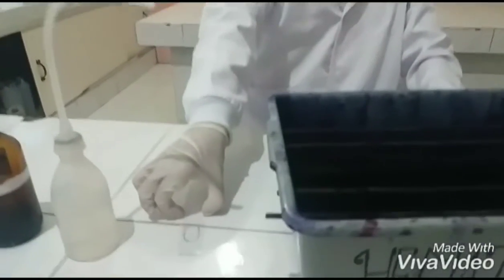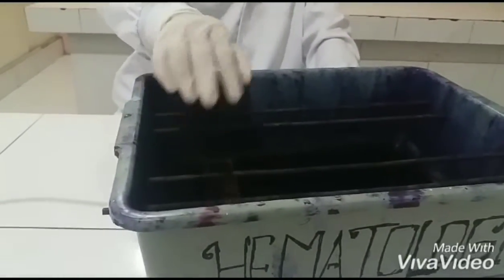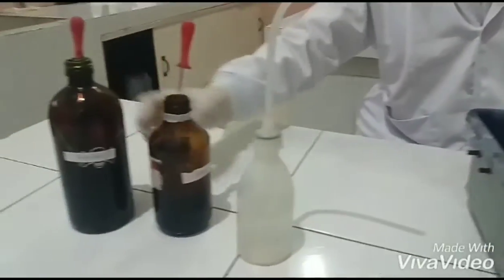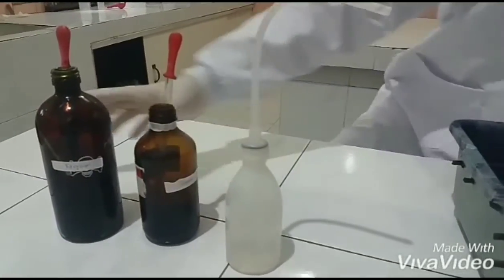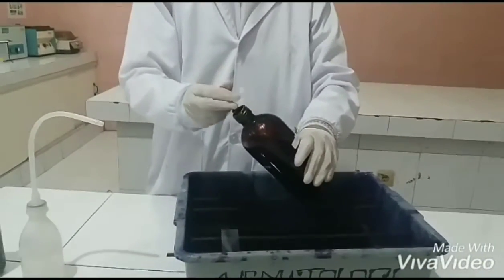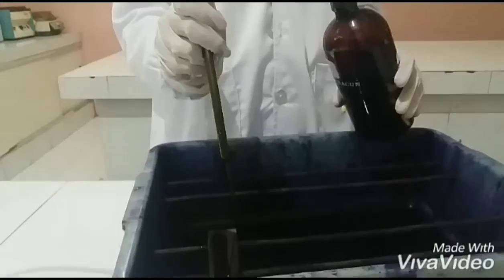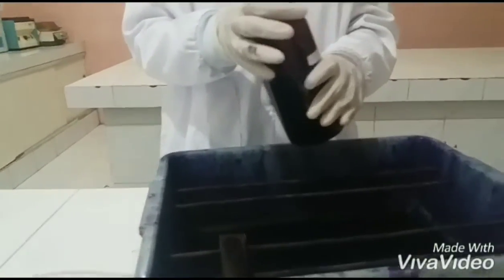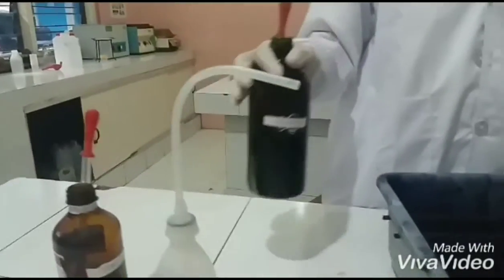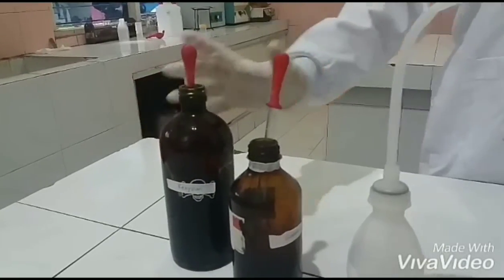And then we take the preparat to the staining rack and add Kinyoun, like this, for 5 minutes.